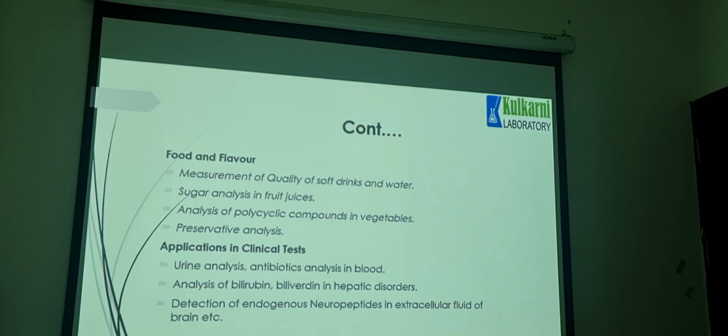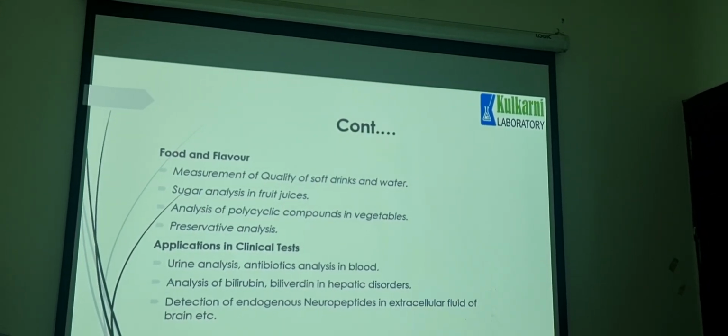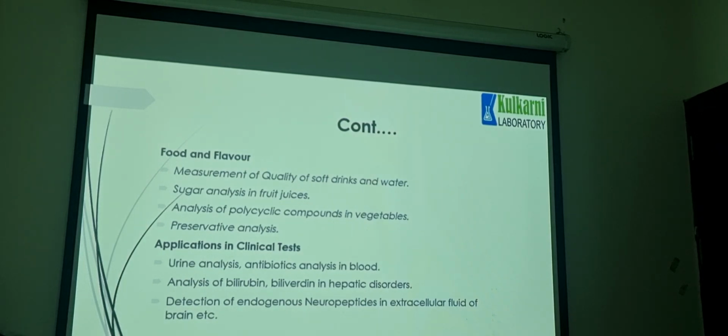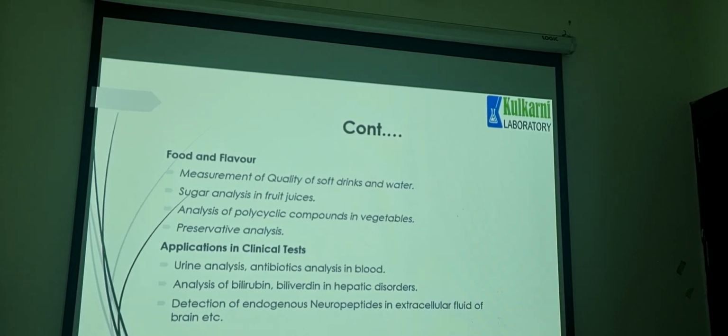Okay. Then what are the other applications in clinical tests? Urine analysis, antibiotics analysis in blood, analysis of bilirubin, biliverdin in hepatic disorders, then detection of endogenous neuropeptides in extracellular fluid of brain. So these are some applications in clinical tests or pathological tests, you can say.